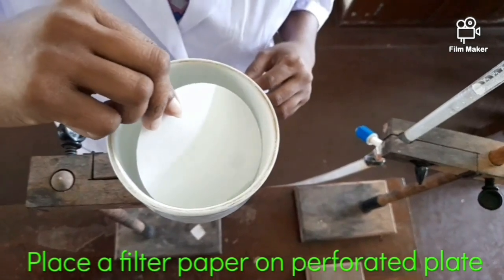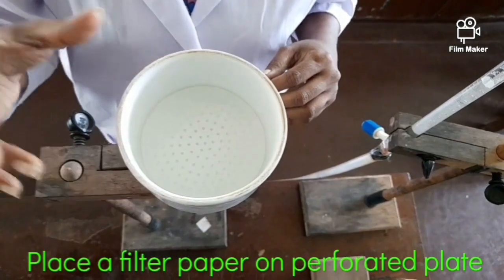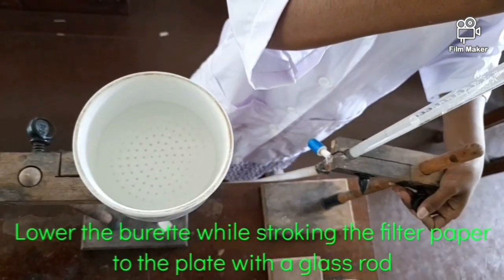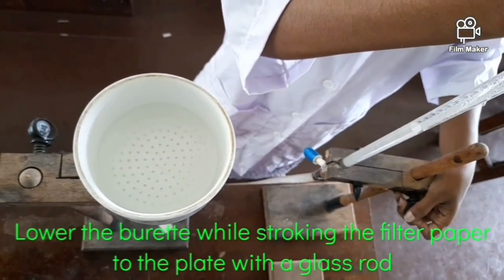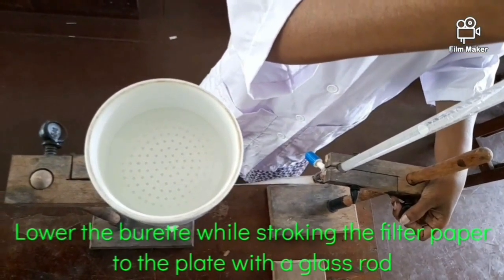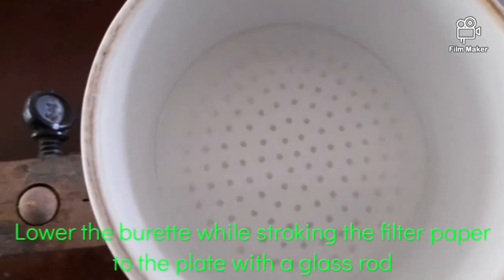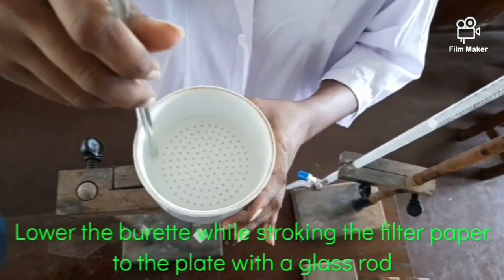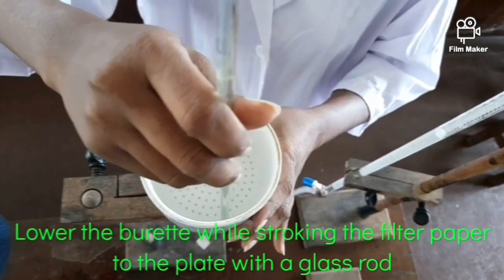Then add a filter paper on top of the perforated plate. Next, lower down the burette until all the water which filled into the funnel is removed. Then, gently pat the filter paper using a glass rod and seal it to the funnel.